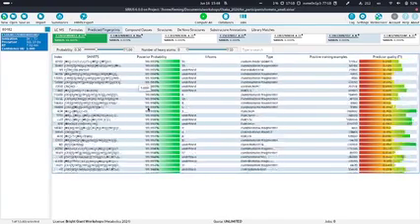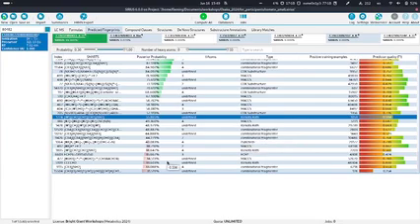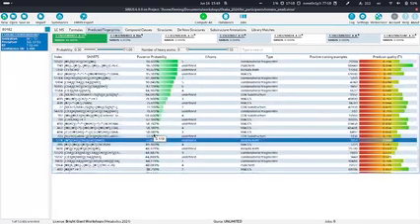I didn't show this, but if you would have scrolled down to the bottom, you would also see. So now this posterior probability, this list only goes to 30, and yeah, you can see the probability of the substructures which are at least mostly predicted to be present. What you can also do is filter by the number of heavy atoms.